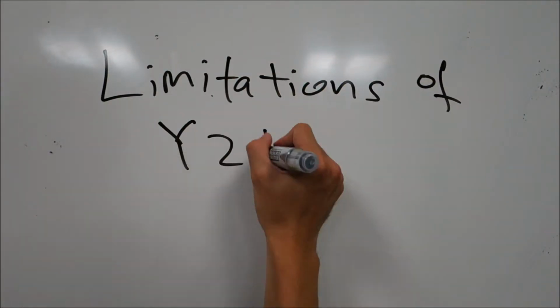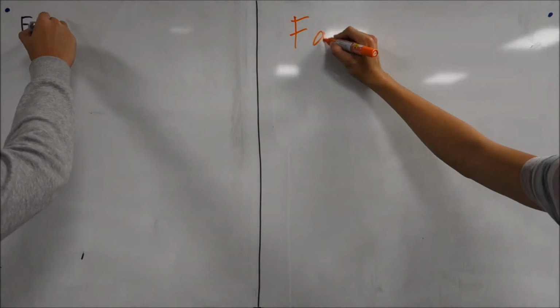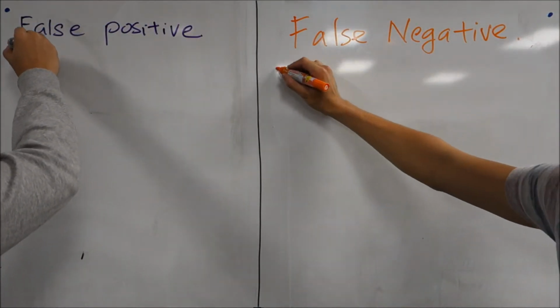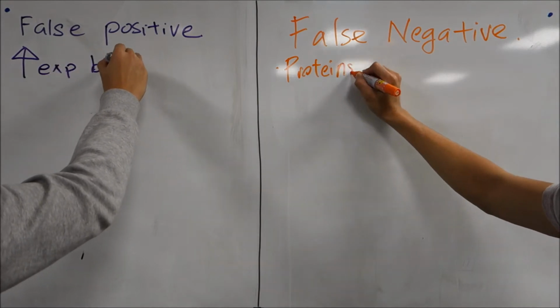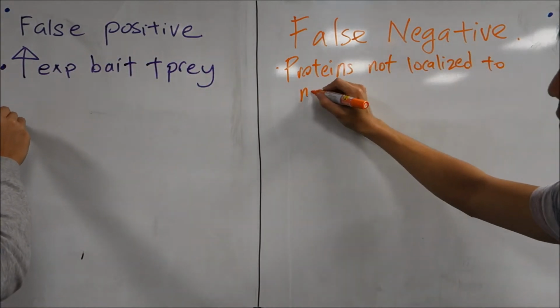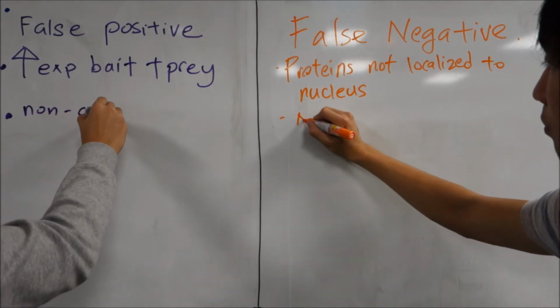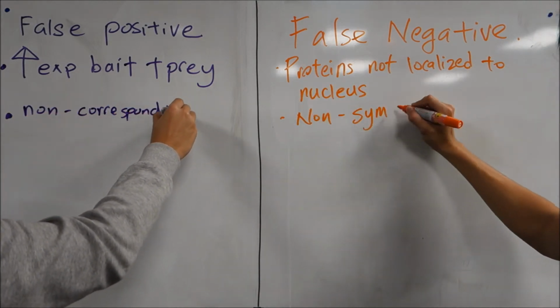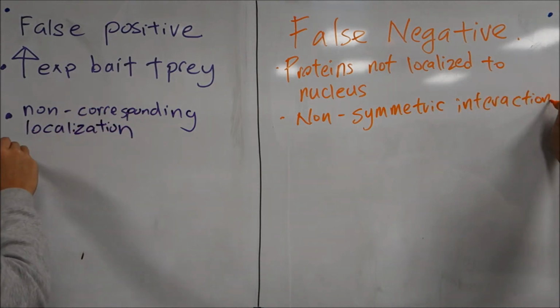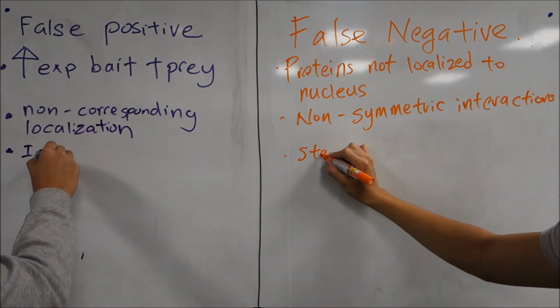Despite the controls that have been made, yeast-2 hybrid methods still involve other possibilities of false positive and false negative identification, hence limiting their usage. Other false positives could result from the overexpression of bait or prey protein. Also, some proteins might specifically interact when they are co-expressed. However, in real physiological conditions, they have never been present in the same cell at the same time.